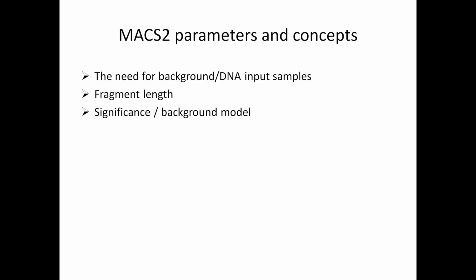The Poisson statistic is the probability of observing the reads in the candidate region with lambda as its expectation.